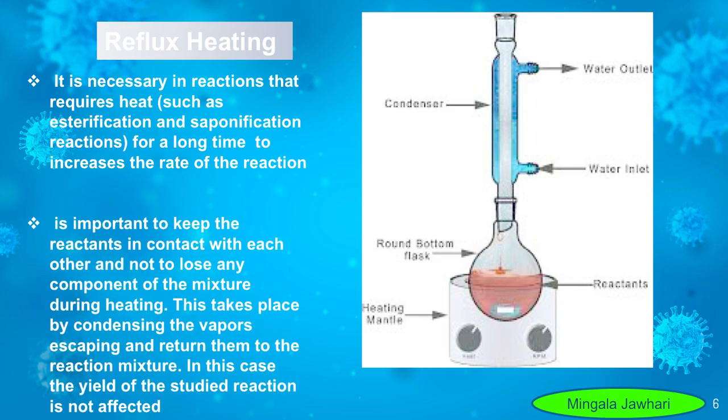So what is the importance of this flask? This flask is used in order to heat the mixtures for a long period of time, okay, and not to allow the components of the reaction mixture to be lost, so that the yield needed will not be affected.